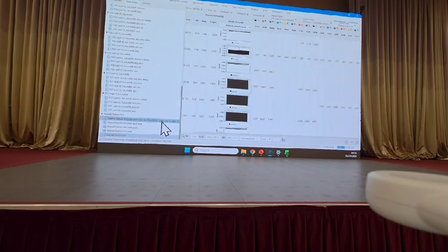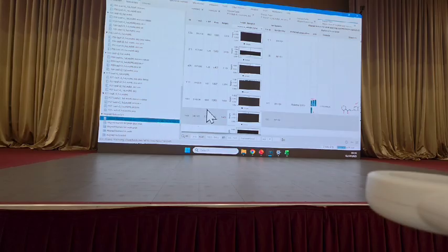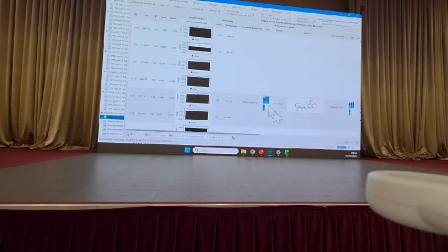And ultimately, we created this final feature table after filtering steps and spectral library matching. And you can see we have some annotations. So this just goes back to highlighting that we can take an unknown metabolite. Before, this didn't have any annotation. And then we took the fragmentation of that molecule and we matched it to the library fragments as well.